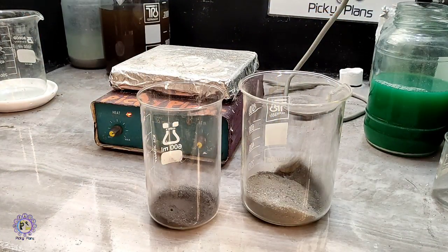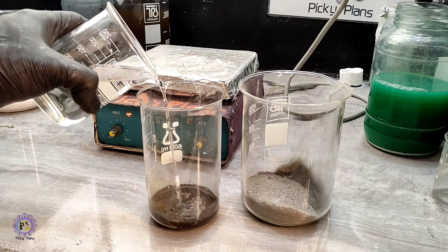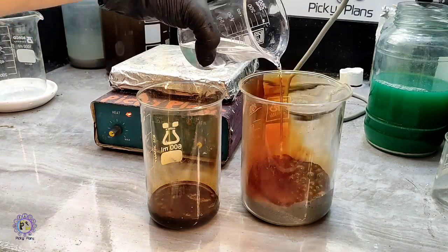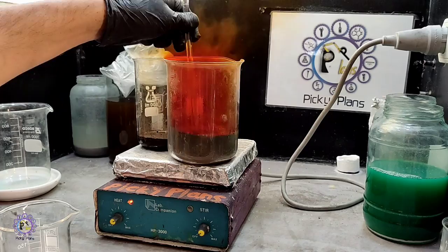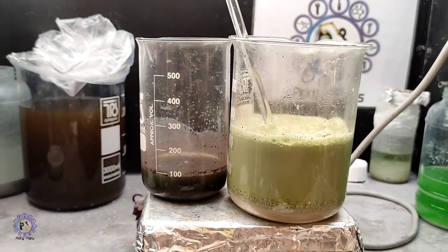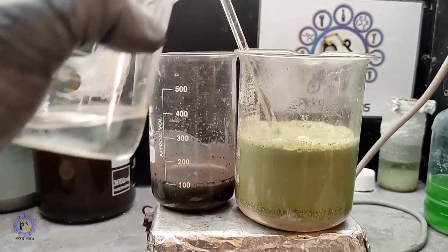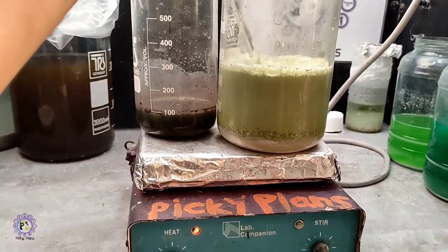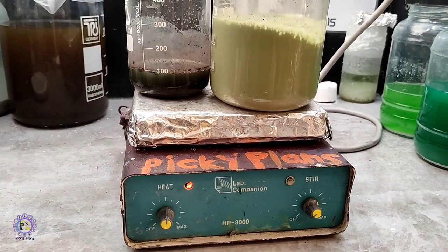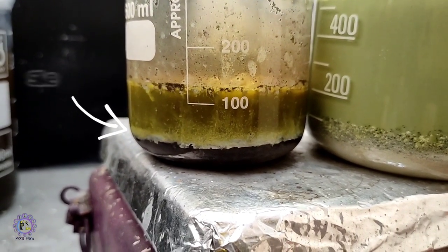Magnetic and less magnetic. And now I add nitric acid to both to start digestion. By solution color and stannous chloride test, it seems there is no palladium in the solution, but absolutely there is silver in the solution. So I added some hydrochloric acid to make aqua regia to dissolve any remaining metals if any trace of palladium is present as a last chance.